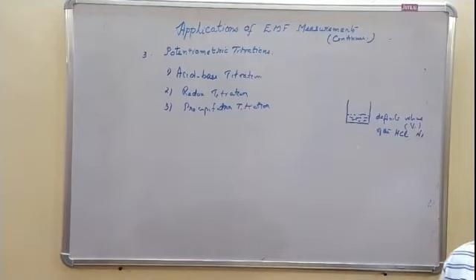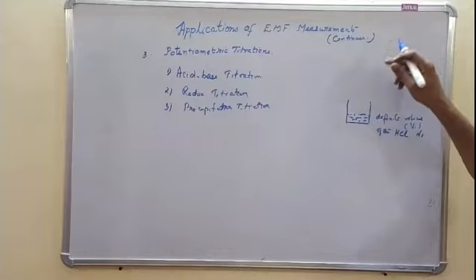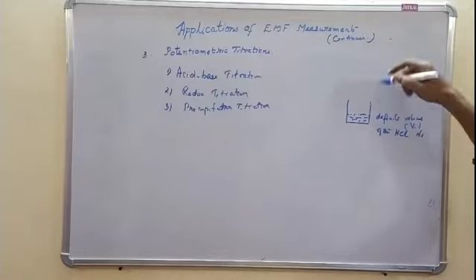And this indicator electrode is then connected to a standard saturated calomel electrode so as to form a cell assembly, and the EMF of the cell is monitored potentiometrically by the addition of the alkali, NaOH, from the microburette or burette.